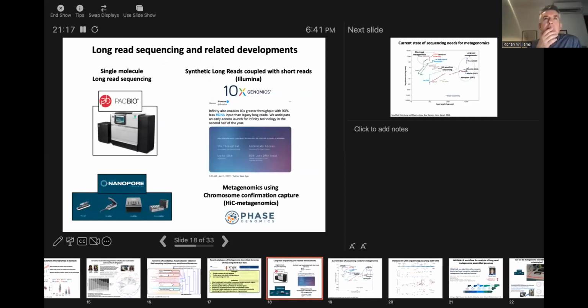So what's changing this game a bit is long read sequencing. Pacific Biosciences and Oxford Nanopore Technologies make single molecule sequencing instruments. If you extract DNA from a cell or cellular preparation and put it into one of these instruments, you will actually sequence the individual piece of DNA. You won't have to go through these complicated procedures where the DNA is broken up into little bits and then PCR'd and so on. You're directly sequencing what's there. So it's a very, very exciting development, and surprisingly easy to use.